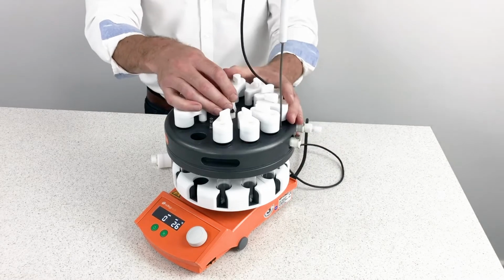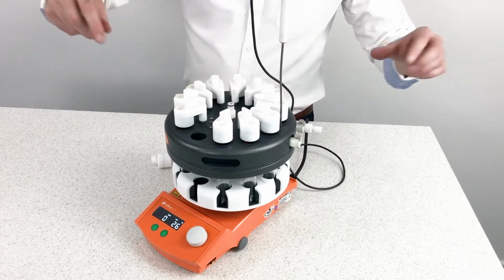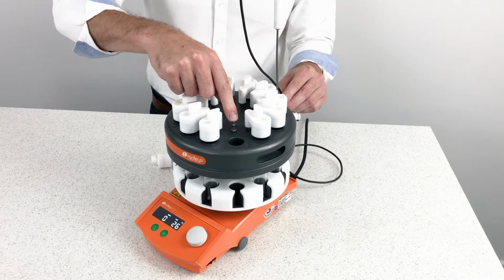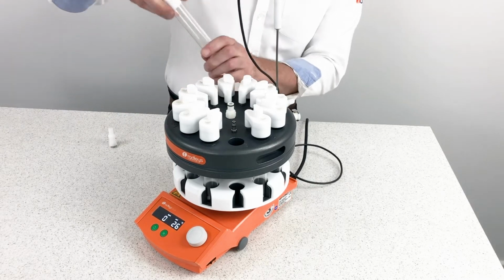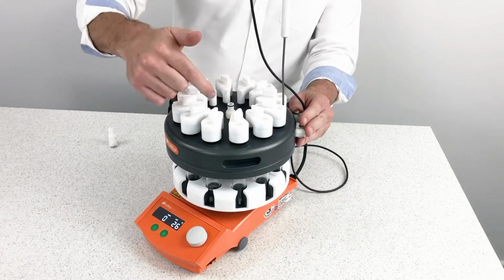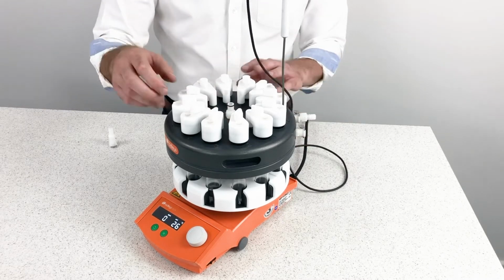You've got a central supply for the inert gas here, and this runs out to all 12 positions of the carousel via these metal pins. So when you attach the easy-on cap to the tube, and then the cap attaches to the carousel, the gas nozzle is automatically connected. You just push the cap down.